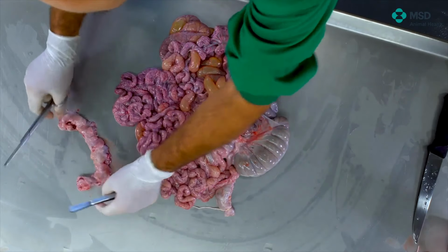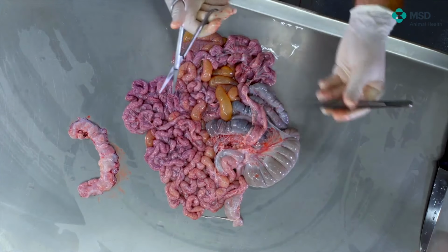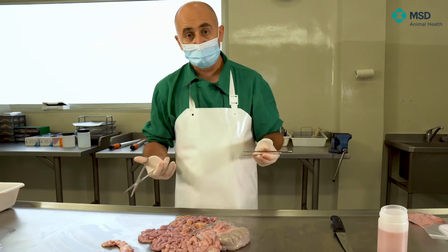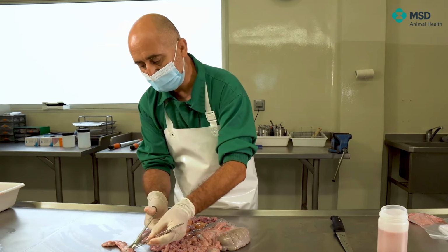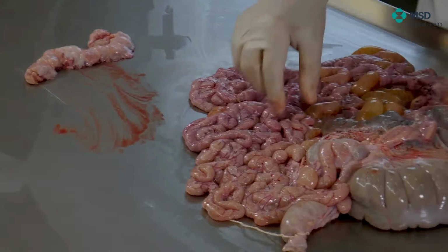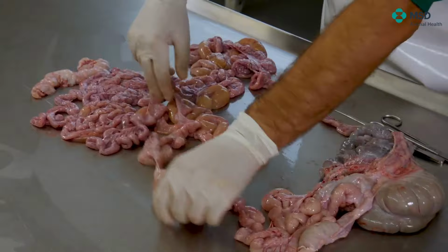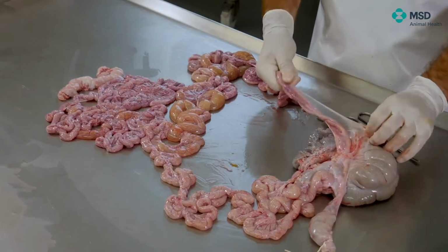Sometimes, following up on some other comments that we made on taking lymphoid tissues, especially for the systemic disease caused by circovirus, taking one small piece of lymph node could be more than enough as well. So by doing this, it's amazing, but we have separated the intestine in a great manner. So now it's relatively easy to know where we are, because remember that here we have the ileum. So we will isolate the ileum a little bit more. Here we have the ileum.